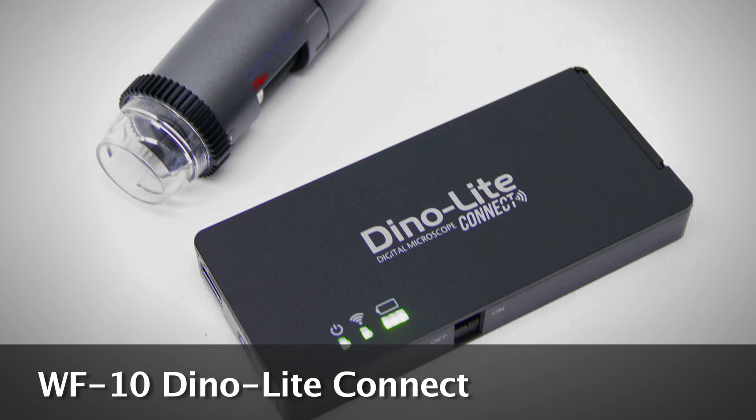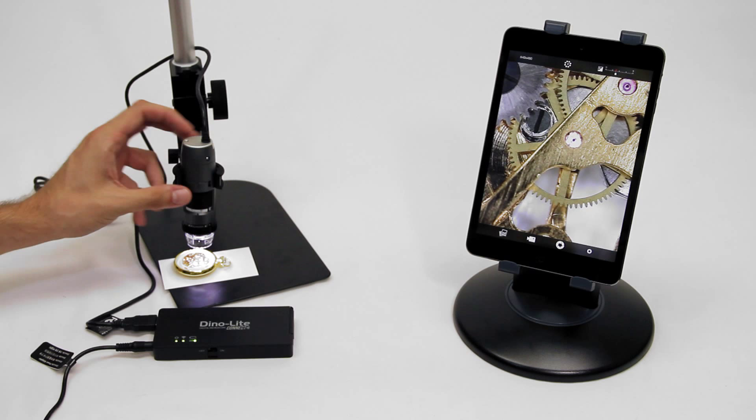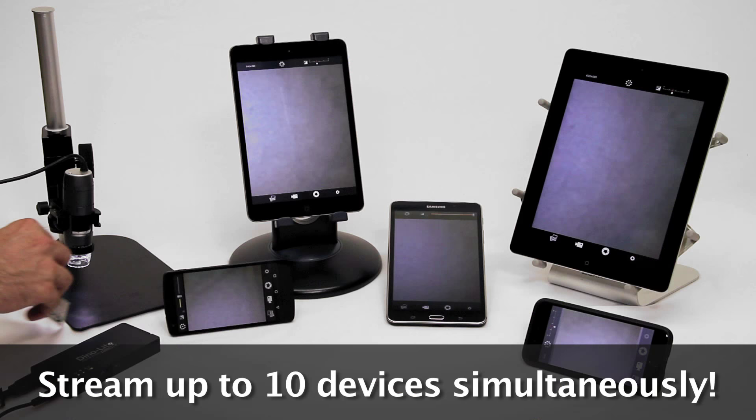Introducing the WF10 Dynolite Connect Wi-Fi Adapter for compatible Dynolite microscope cameras. The Dynolite is connected directly to the WF10 and uses a Wi-Fi signal to stream to up to 10 devices simultaneously.